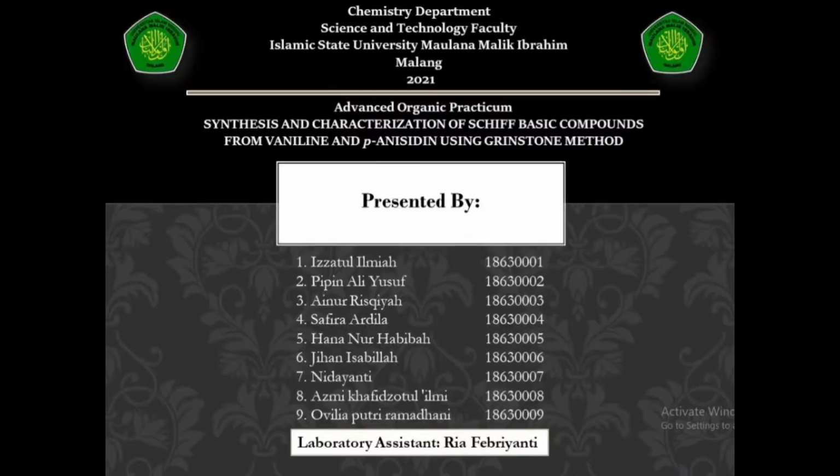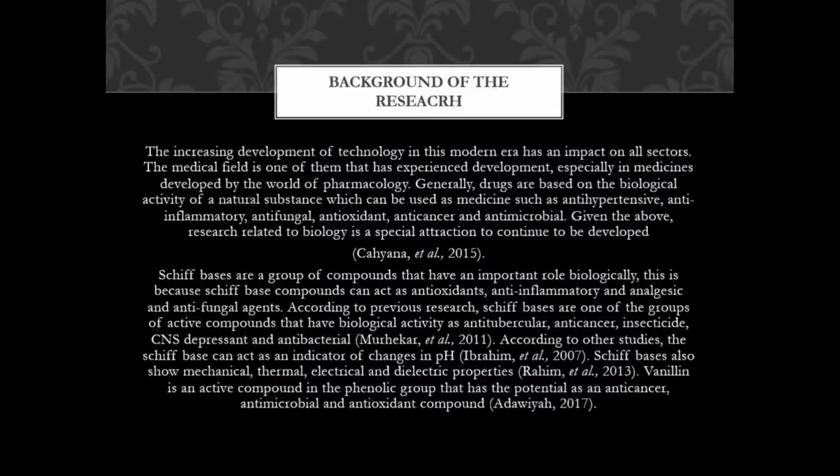Synthesis and characterization of Schiff base compound from vanillin and p-Anisidine using the grinding method. I will explain briefly the background of the research.